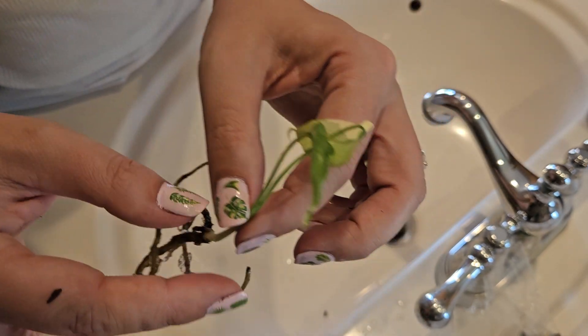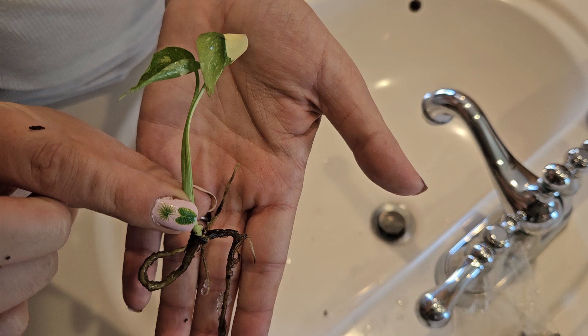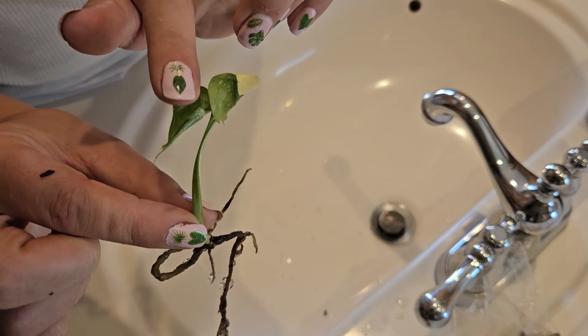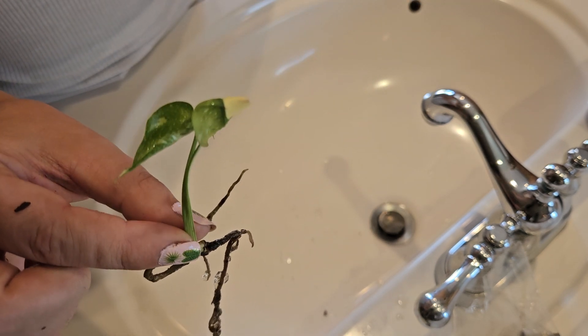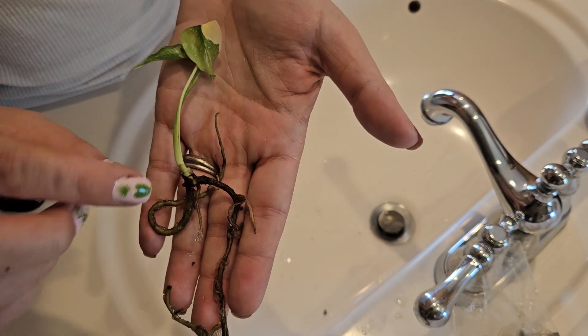You want to pull off any of the lower leaves. It doesn't really matter the plant to us — we always remove everything but the two top leaves. It's just where we see the best success, because you don't want the plant worrying about any of those lower leaves.